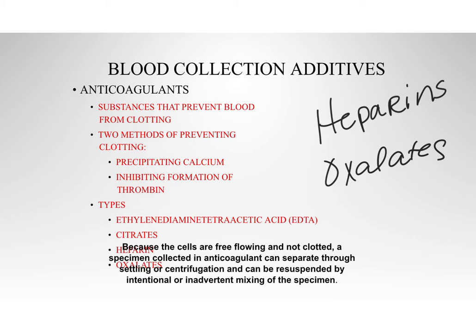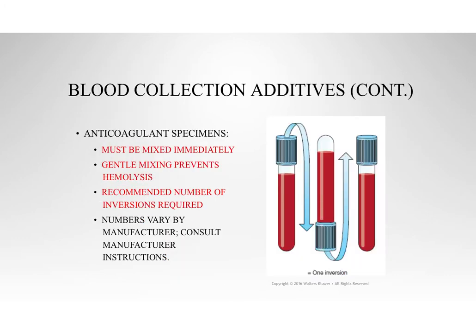The other way that it can separate is when we put it in that centrifuge, that machine that spins really fast. We're going to learn how to use one later, we'll talk about it in lecture, and we will do that in lab, because understanding how to work the centrifuge is an important part of your job, okay? But we'll talk about that later. We're going to get back to the tubes here.